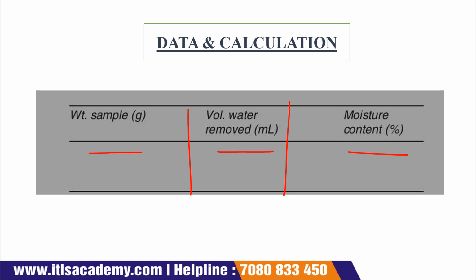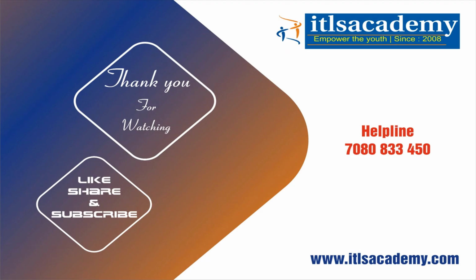So this is all about the determination of moisture content with the help of microwave oven, rapid moisture analyzer and solvent distillation.